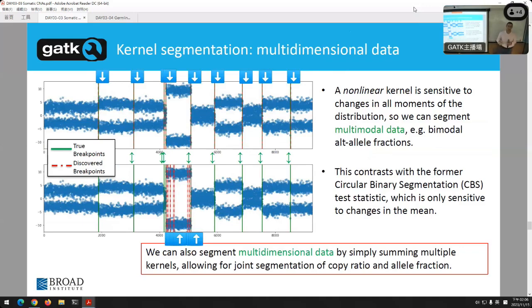But now we figure out how to take both. Again, those allelic ratios, the 1/3 down to 1/4, back up to 1/3, down up to 1/2, really helps you figure out where those segments are. Okay? And so that's what this is saying.